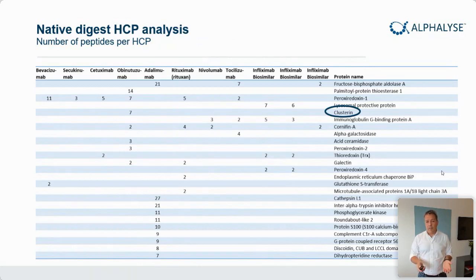We have seen this previously. So not so good that we actually detect 7 peptides in this one drug. We also see protein A, and this is typically bleeding from the column. And this is also something you should investigate when you look at your samples, that you should show to the regulatory authorities that you don't have protein A bleeding from your column.